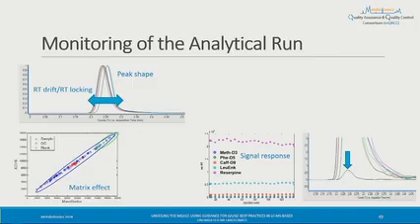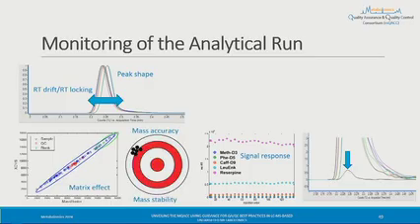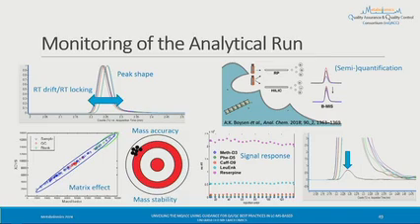So for example, my lab works with the normal and highly lipemic samples. So we use internal standards to look, do we have different matrix effects between lipemic and normal samples. You can look at things like mass stability, retention time drifts, and then they can be used for semi-quantification. This is more in a lipidomics community than a metabolomics community.